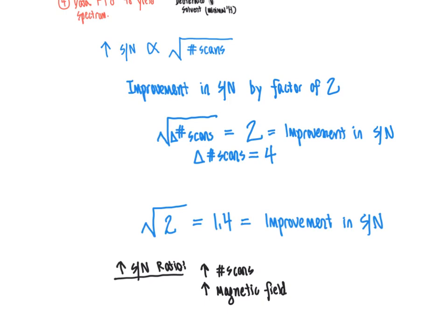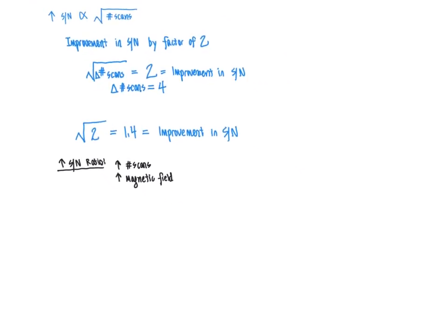And keep in mind here, when we think about the sensitivity of NMR and the sensitivity of this experiment, the signal-to-noise ratio you can ultimately obtain is based not on the mass of material that goes into your NMR tube, but instead on the number of molecules that go into the NMR tube, or the number of moles, in other words. And so as a result, the molecular weight of your compound determines how much compound you need in order to be able to collect a suitable NMR spectrum.